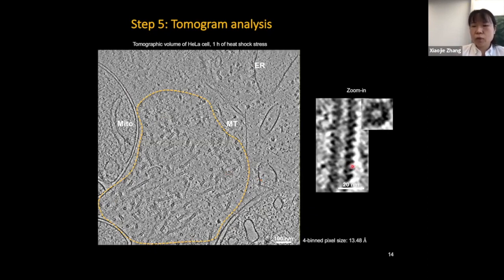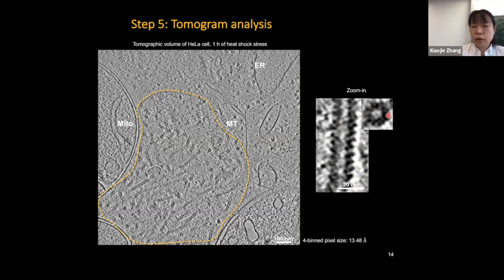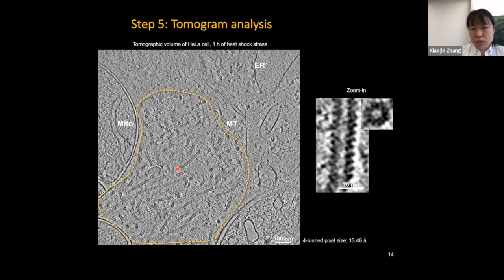What was striking was that we observed a large patch of filamentous structure at the region presumably corresponding to stress granules, based on our correlative pipeline. Zooming in, we can see these filaments display repetitive features along their length, indicating a helical structure — and the filaments are hollow in the middle. Since we were targeting stress granules, we were very excited and thought these filaments might be scaffold proteins and structures of the stress granules.